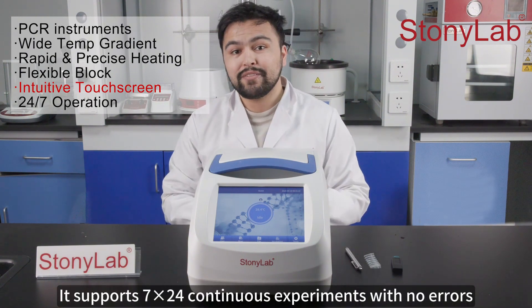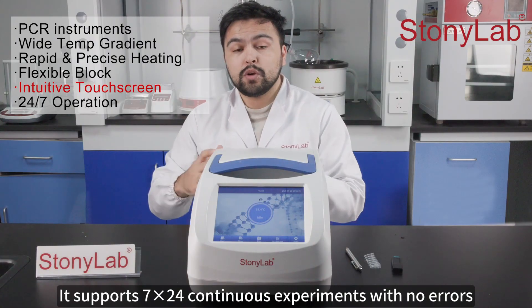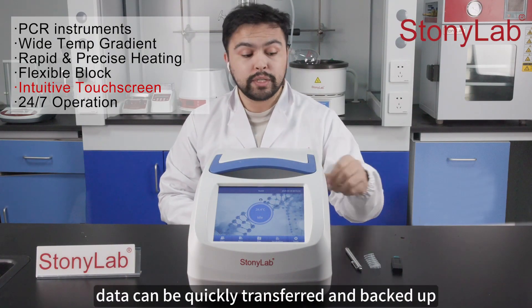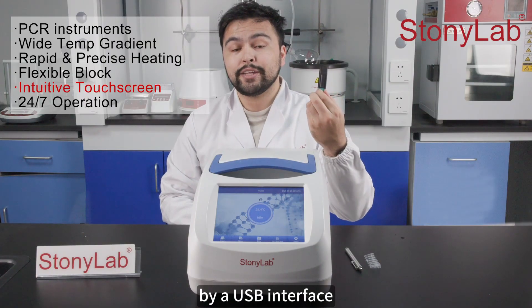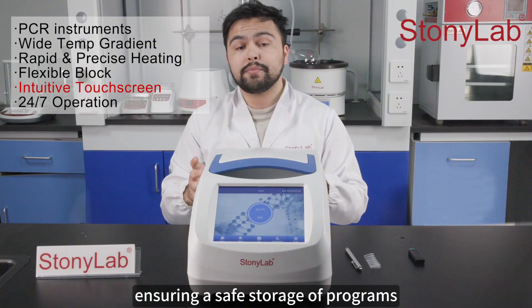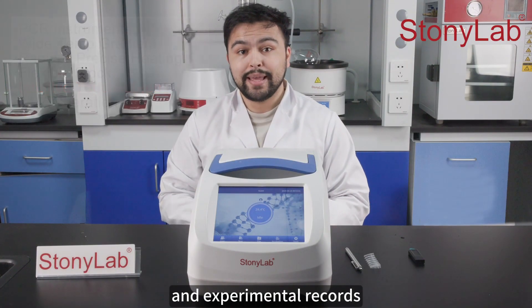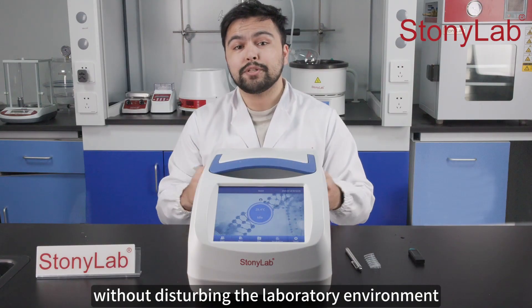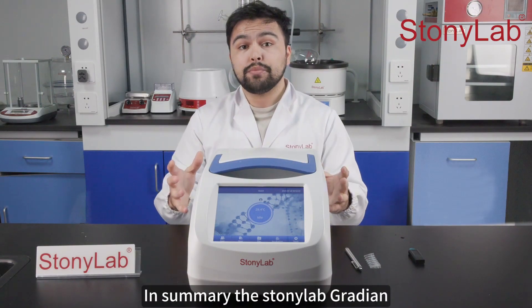It supports 24-7 continuous experiments with no errors during prolonged operations. Data can be quickly transferred and backed up via a USB interface, ensuring safe storage of programs and experimental records. The silent exhaust fan operates without disturbing the laboratory environment.